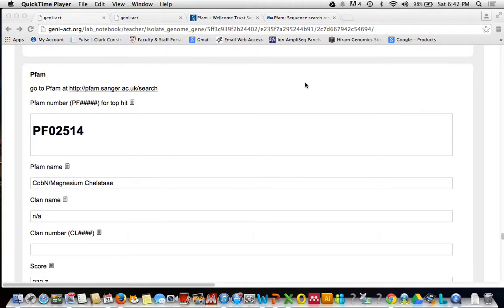Hello everybody, now we are moving on to Module 5. We are skipping Module 4, you are not required to do Module 4. And Module 5 is structure-based evidence. So go to your notebook, scroll down until you find Module 5, structure-based evidence.